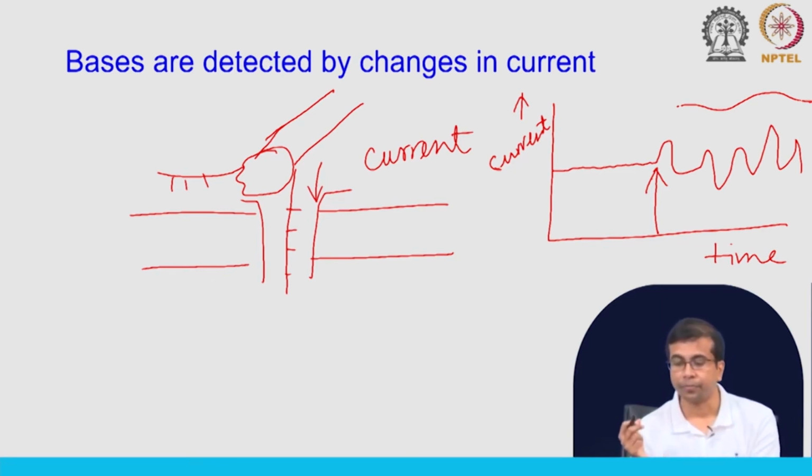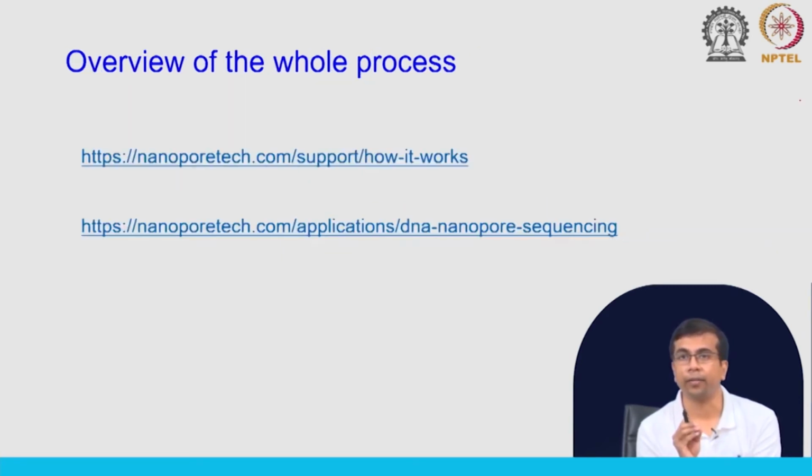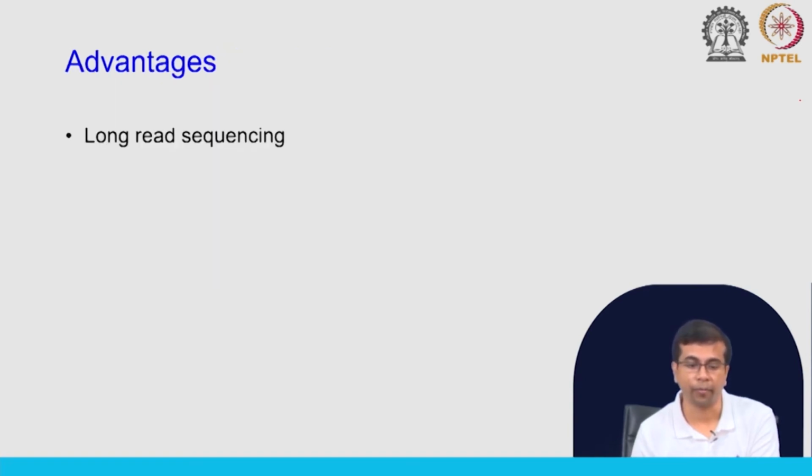Okay. So, I hope this is clear, the general principle of how nanopore will detect the DNA bases. Okay. Here are the two links where you can actually see some animation that will make the whole process clear to you and you will get a better understanding. So, please have a look.